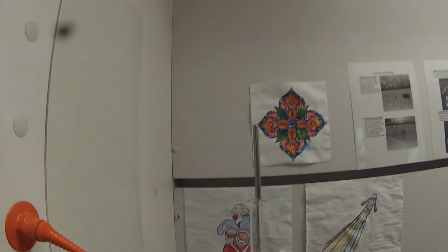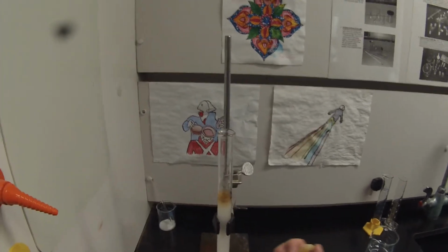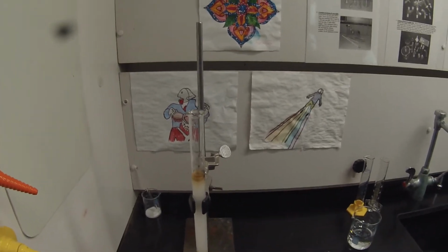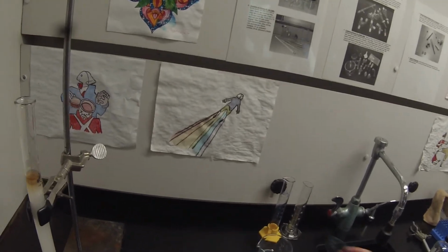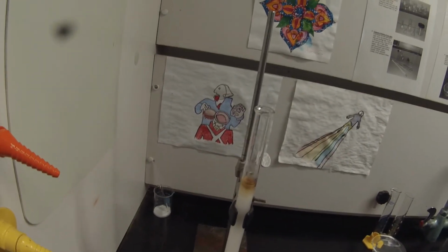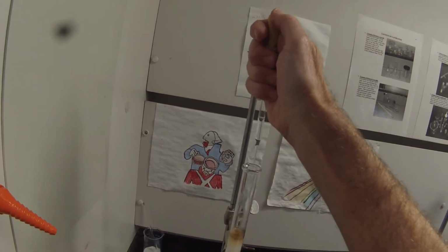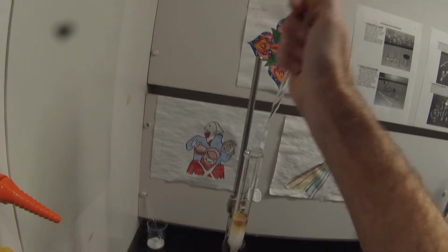So I'm going to wait for that meniscus to hit the top of the sand again. And then I'm going to flush it in with a little pet ether. And by using some pure pet ether here before I switch to the mixture, I will also counteract the effect of adding a little bit too much volume. So the key here is not to let it go dry.